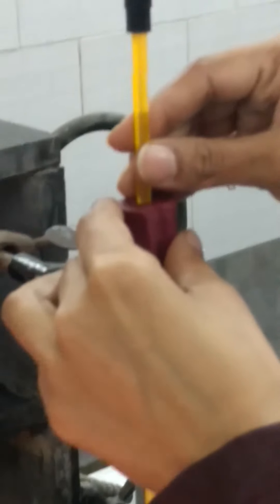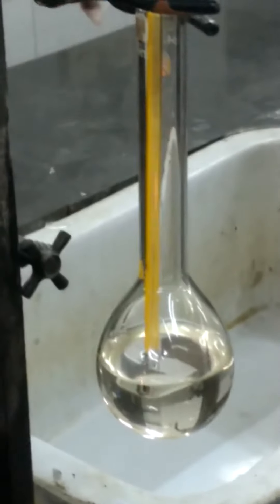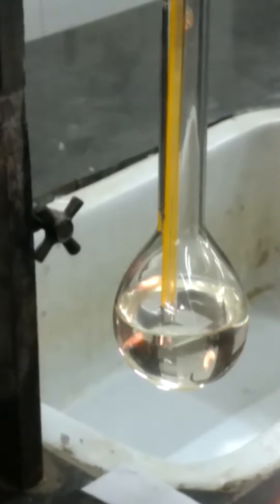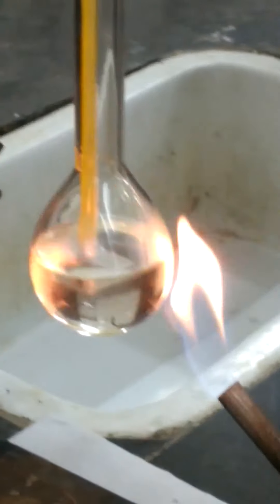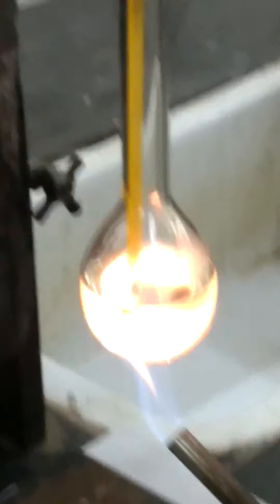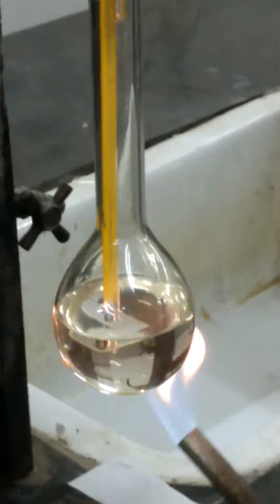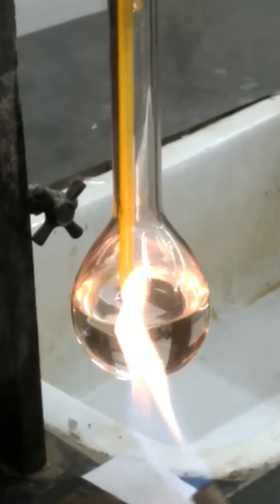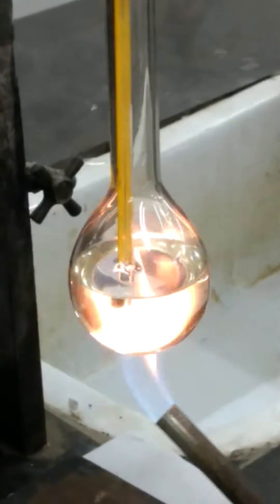Adjust the thermometer so that the bulb of the thermometer is dipped in the liquid below, and so is the level of the capillary. Now start heating it slowly. You can easily visualize the temperature rising in the thermometer and also the state of the compound in the capillary. Rotate it so that the liquid gets uniform heating.